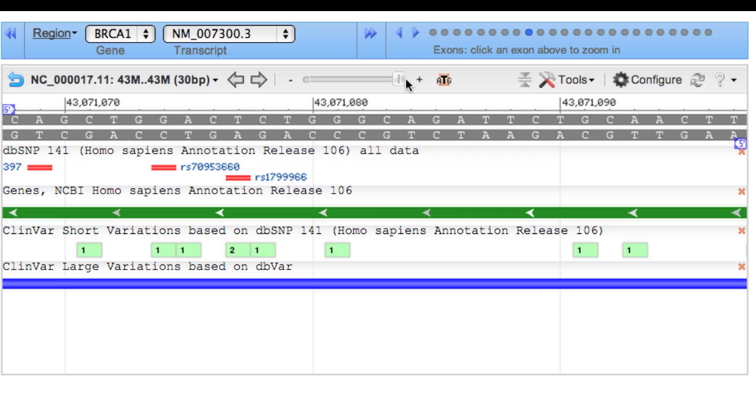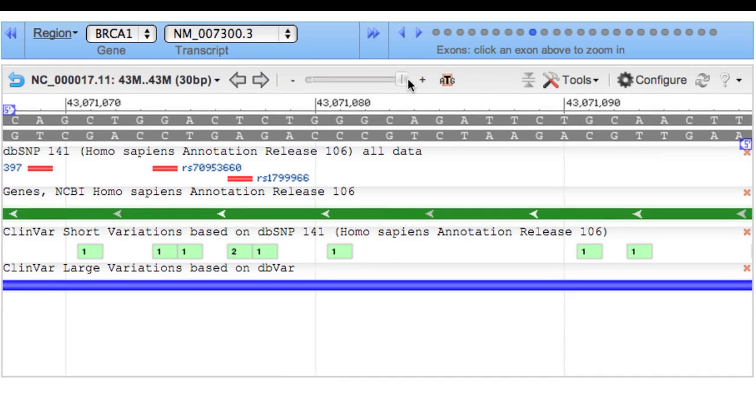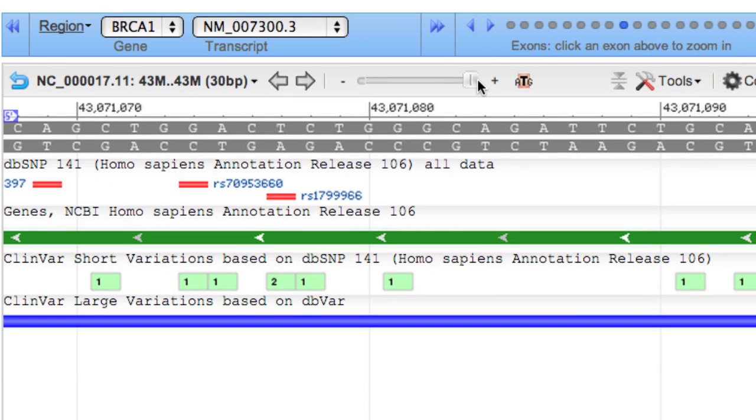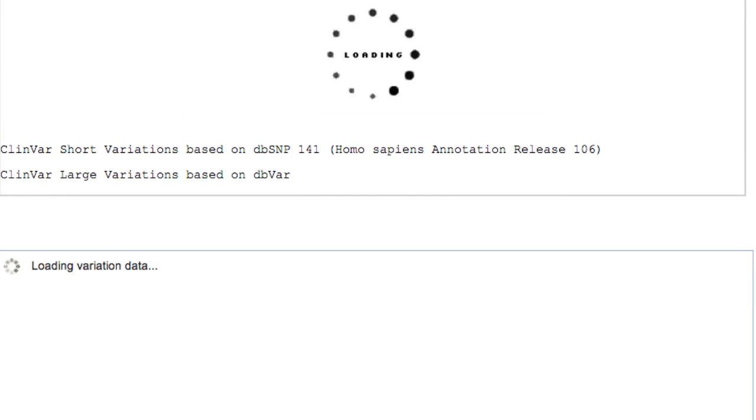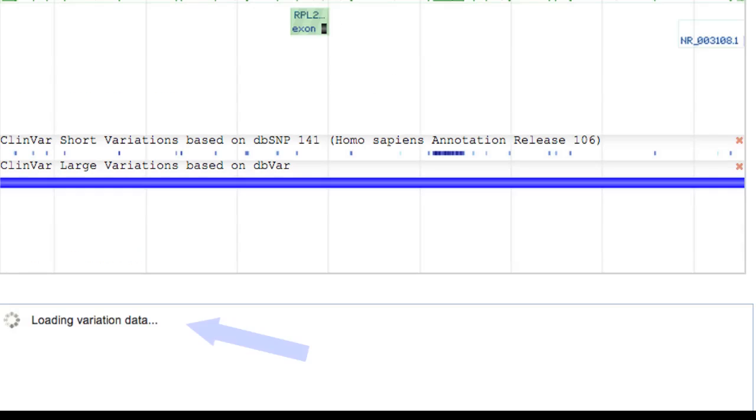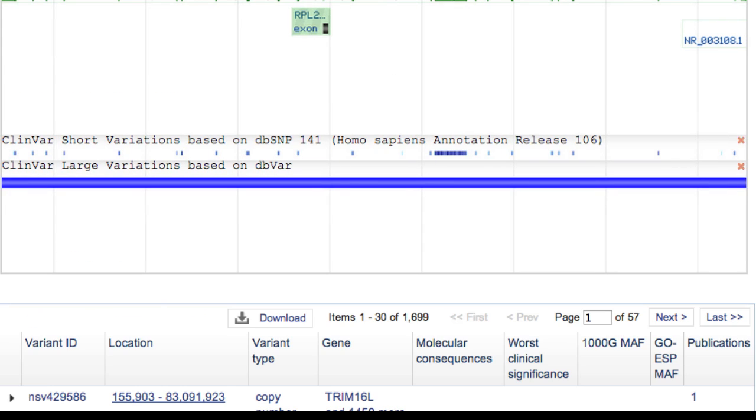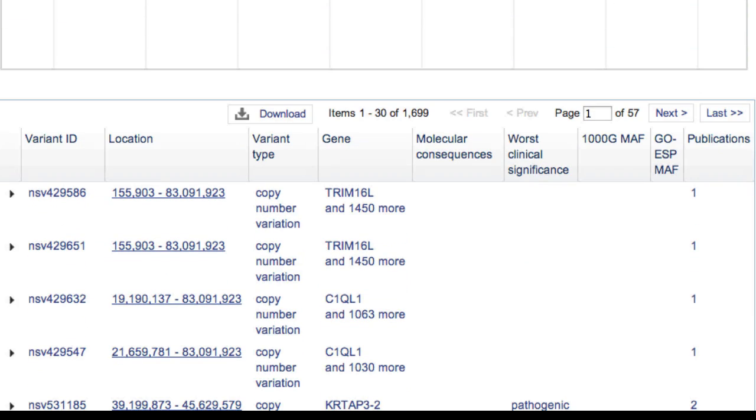To get back to the whole gene display, use the Region options. Notice that as you change the region displayed, all components, including the variant table, automatically update to show records in the new sequence range.